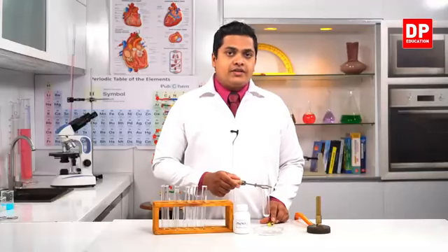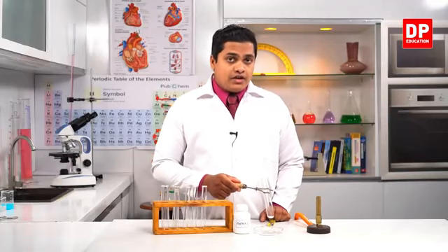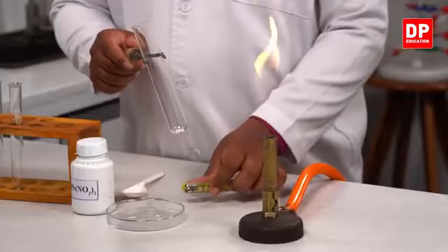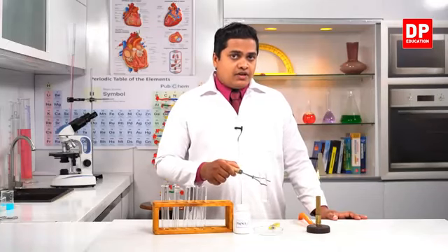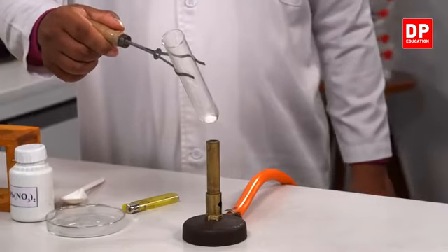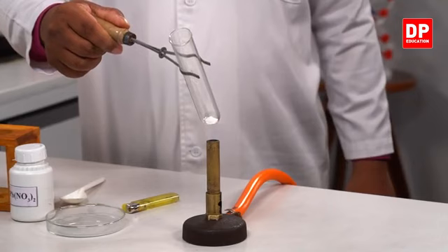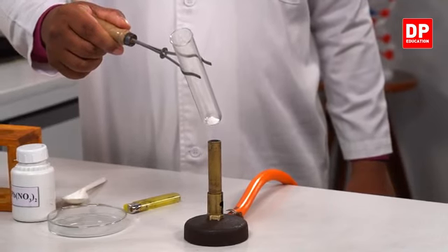Right, my dear children, now let's heat the system and let's observe what kind of thing is going to be emitted when I heat this lead nitrate in the boiling tube. Right, now my dear children, I'm going to heat the system. Observe the changes very well. So let's get the observations.